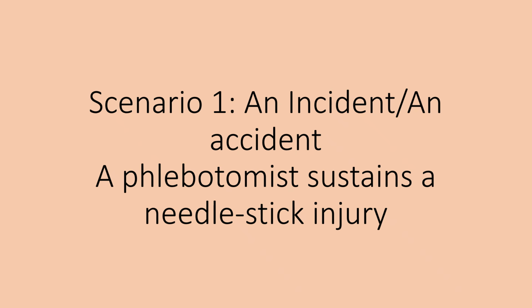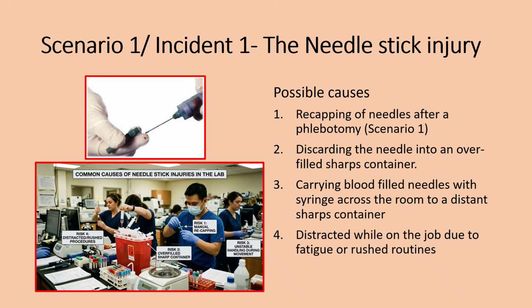discussed so far. The first scenario is an incident that happens or could happen in the pre-examination phase. A phlebotomist sustains a needle stick injury. Scenario 1 or incident number 1. The needle stick injury.